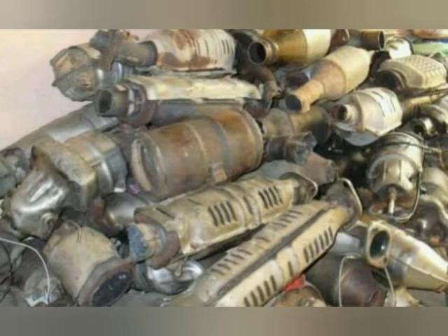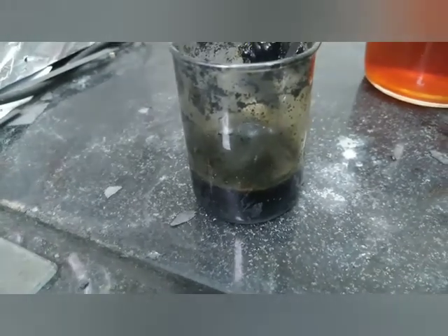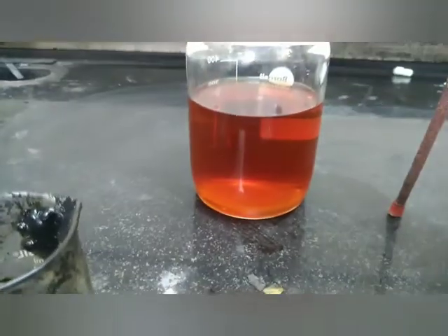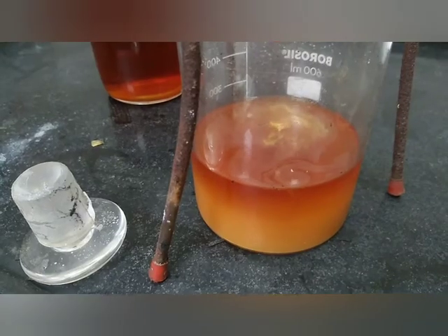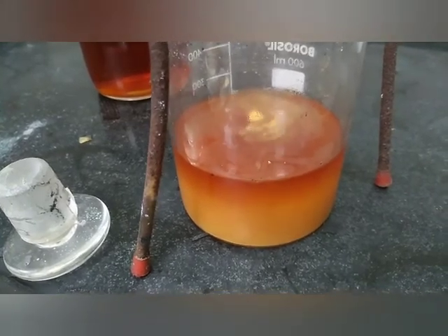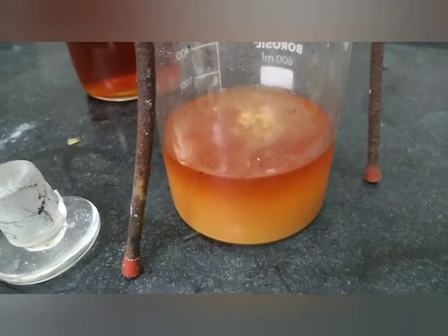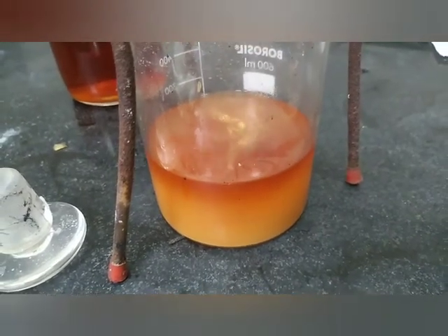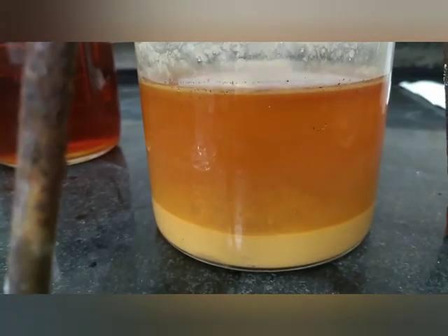Filter it and transfer it into another beaker. Now you have to prepare a one molar ammonium chloride solution, which we will use for the precipitation of the platinum. You can add this solution in one shot or dropwise to get the yellow precipitate of ammonium hexachloroplatinate. After complete precipitation, you can filter the solution.